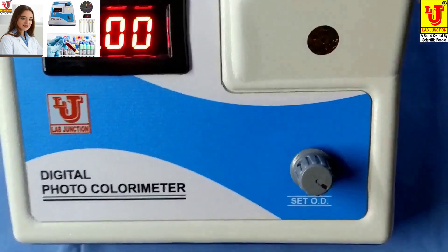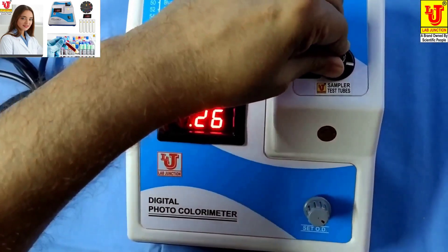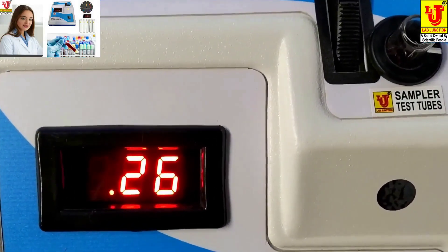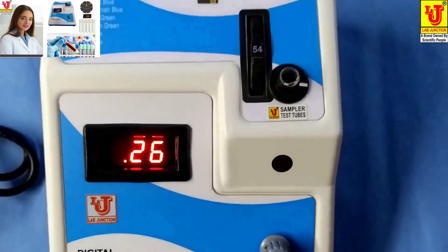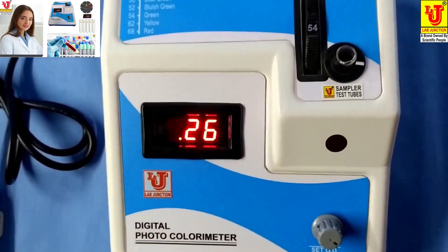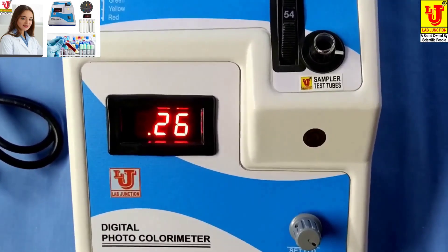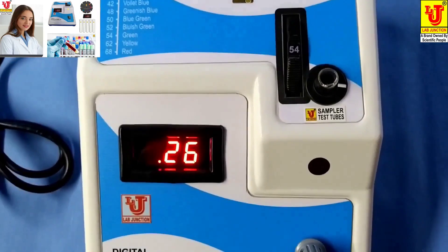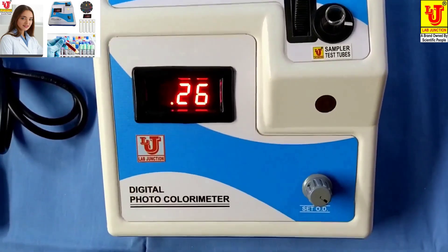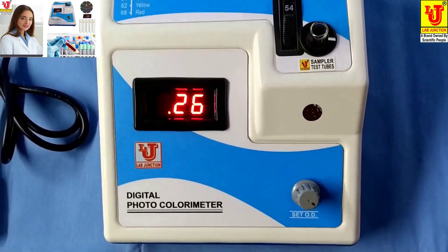Now insert your sample like this. This is your result in absorbance or optical density of your sample. Then take the absorbance or optical density of your reagent, and calculate using the formula. This is the final result; after that, do the calculation as per your parameter.